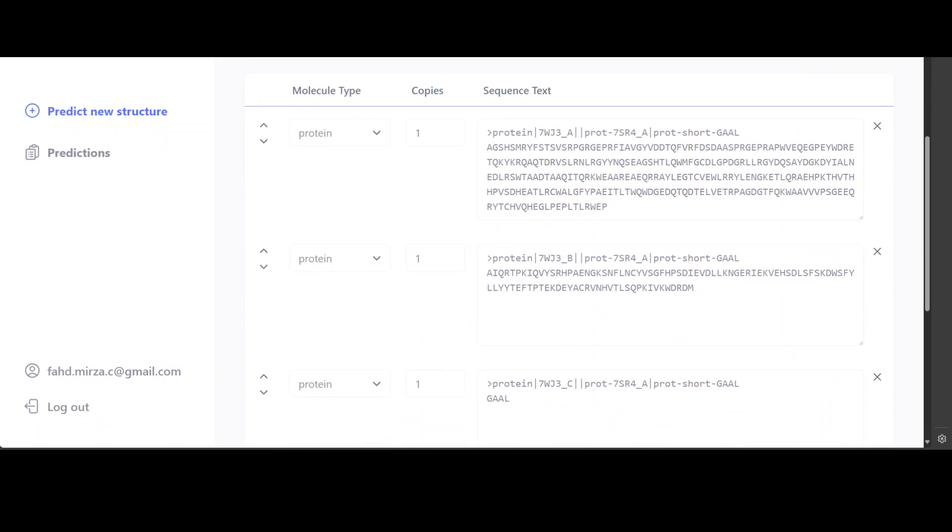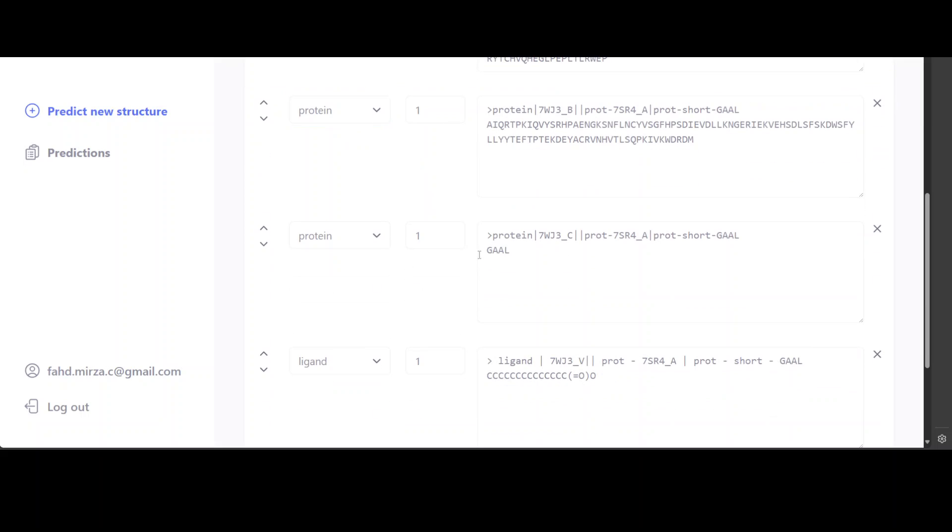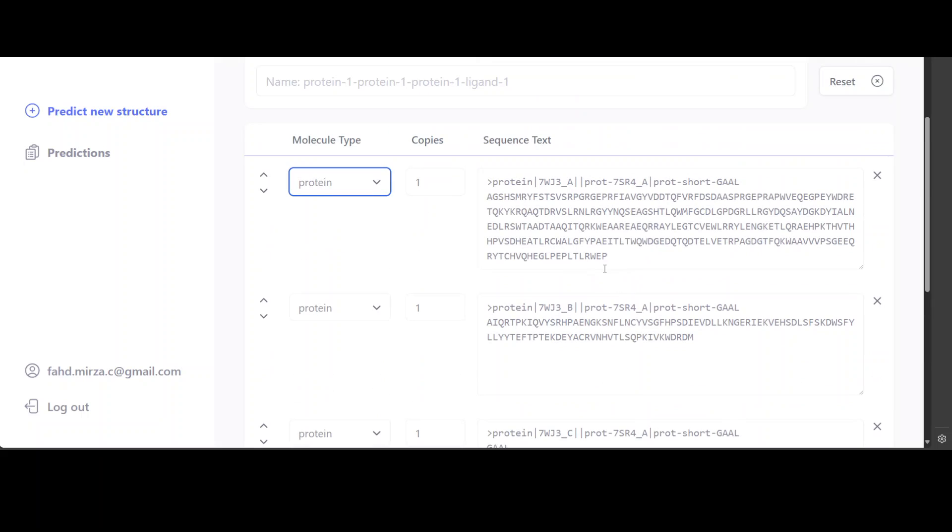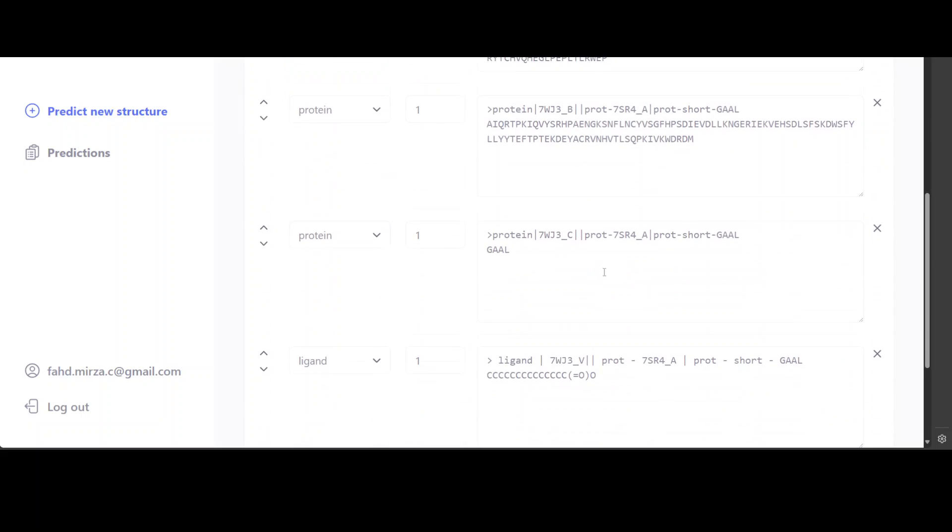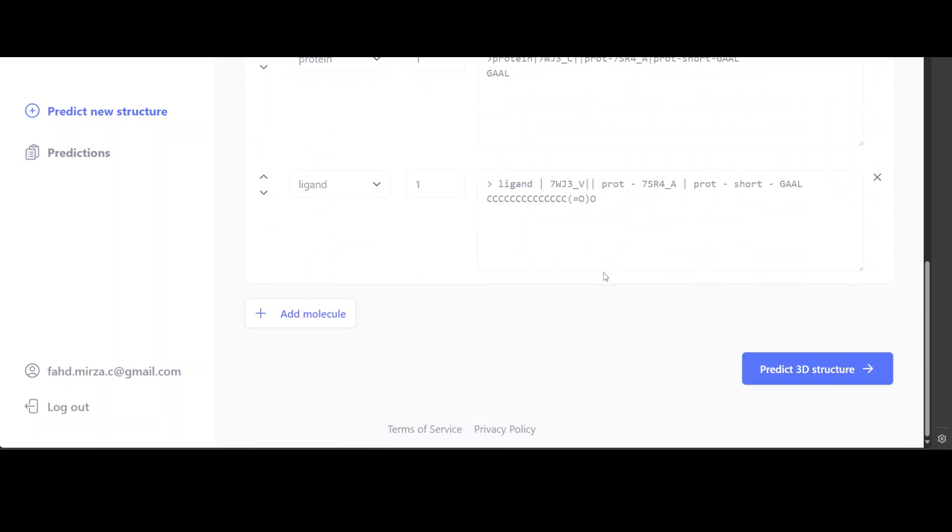Or you could just go with your own molecule types like protein or DNA, RNA, which I was showing you earlier. And then this is where it is giving you sequence text. And then from here you can predict the 3D structure by clicking on it.